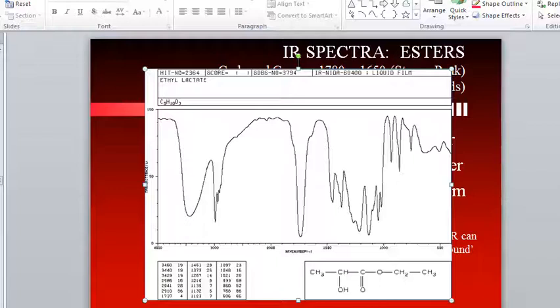So because of that, I'm going to call it an ester slash ketone. I'm probably going to put money on the ester because there's more than one, of course, but I'm not really sure. So I'm going to put both of them down. I'll give you the benefit of the doubt. I'll give you a check mark, and you get the answer to the question.